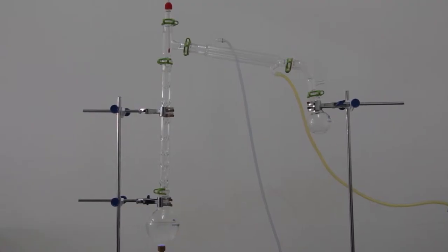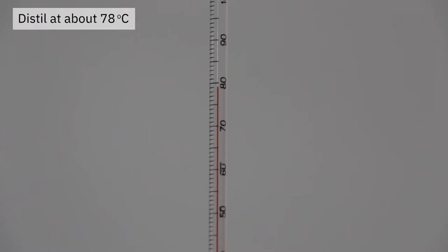The fractional distillation apparatus is set up as shown. The distillate previously is then transferred here and allowed to distill at a temperature of about 78 degrees Celsius. Ethanol is collected.